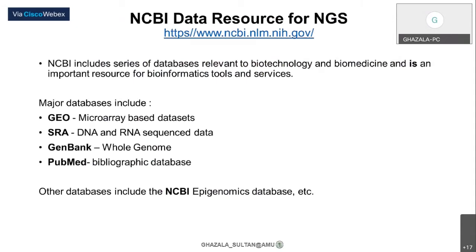But right now, since we are focusing on NGS, we can get RNA-seq or DNA-seq sequence data from SRA, which is inside NCBI. SRA is the acronym for Sequence Read Archive. We will check that in the practical session as well after this.